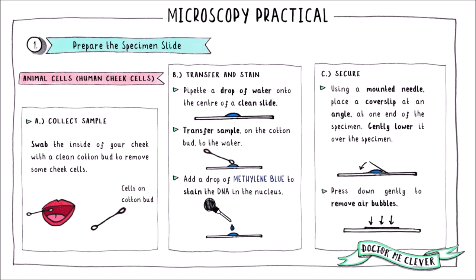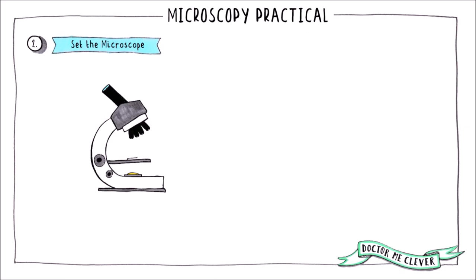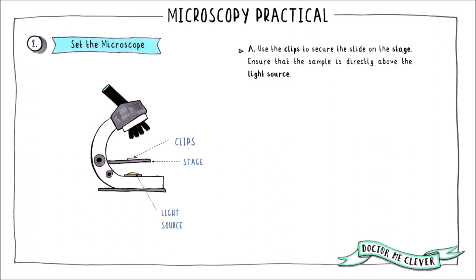Methylene blue stains DNA and will make the nuclei more visible. Then lower a cover slip over the sample and remove any air bubbles. Once your sample slide is ready to view, it is time to set up the microscope.